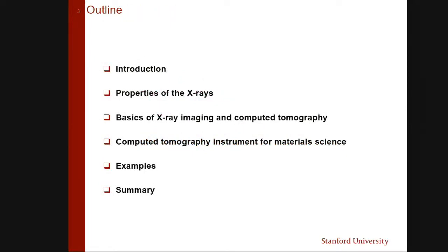This is a brief outline. I will try to stick to it, though not necessarily rigorously. I'll talk a little about the introduction, which relates to X-rays in general, then the properties of X-rays, and then basic X-ray imaging: why we have images with X-rays, and what computer tomography is. Then I will show you the instrument which I have in my lab, and there are many instruments of this type which work on the same principles. Then, of course, the coolest part will probably be the examples, where I'll present different materials and samples measured using this CT. And then a summary.